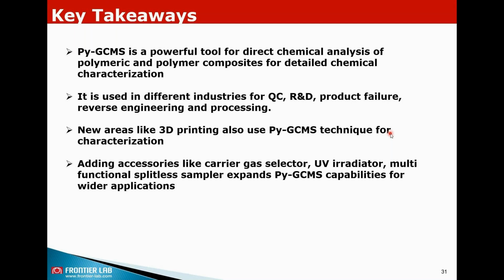You can also treat the sample at high temperature, and manage the analysis with very little sample, less than 0.1 milligram. It is widely used in different industries for QC, R&D, product failure, reverse engineering, and processing. Processing again is part of the R&D work. And new areas like 3D printing also see the value of PYGCMS for 3D printing material characterization.